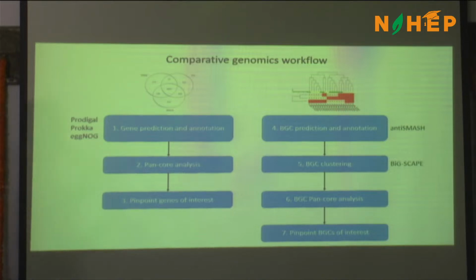So this is a typical workflow for comparative genomics. You always start general, but then depending on what you find or see in a general overview, you can use more specialized databases to pinpoint the specific genes that could be the cause of your phenotype, okay?